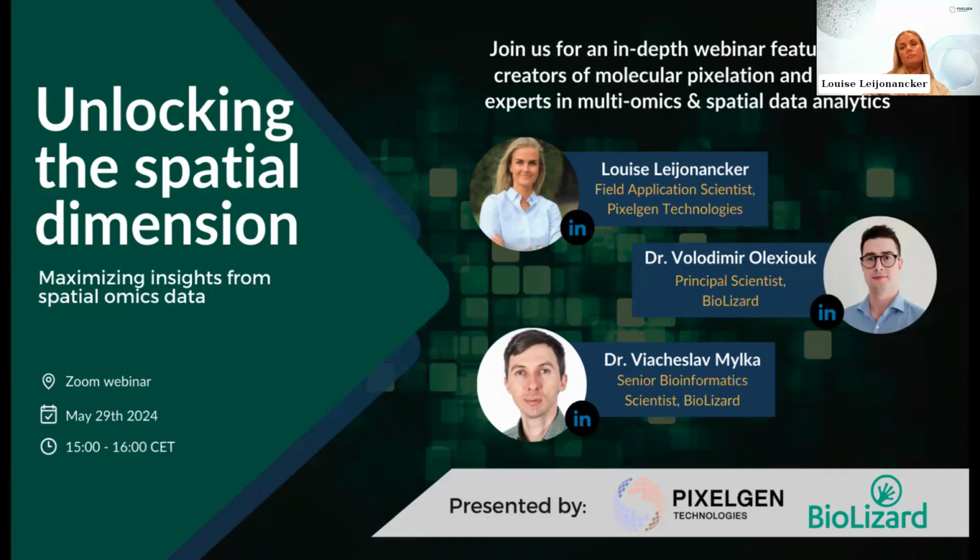I don't know, Slava, if you want to try to answer that one. So if the question is for different omics, meaning spatial proteomics or spatial transcriptomics, how we account for resolution? Well, you can see that different methods have different resolutions indeed. So you need to take this into account by checking if you have single cell resolution or not. If you don't have, then indeed you can apply those methods to computationally bring it to single cell level.